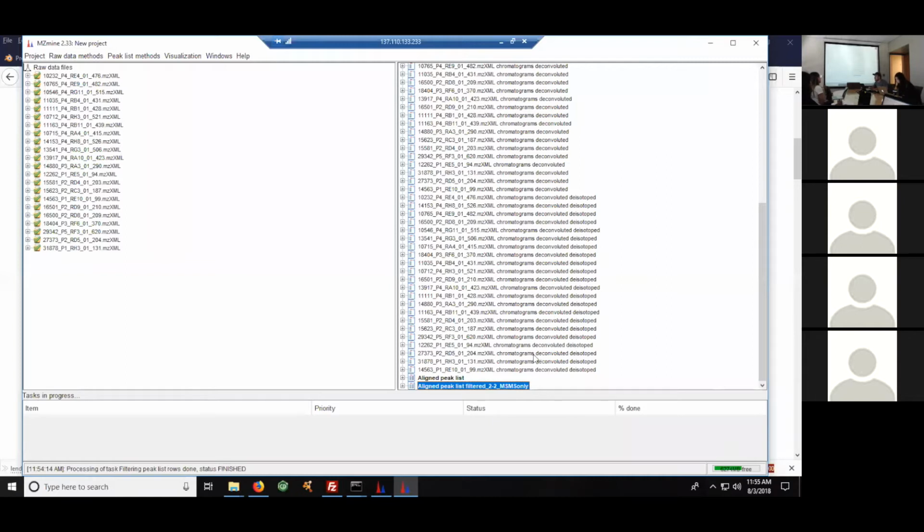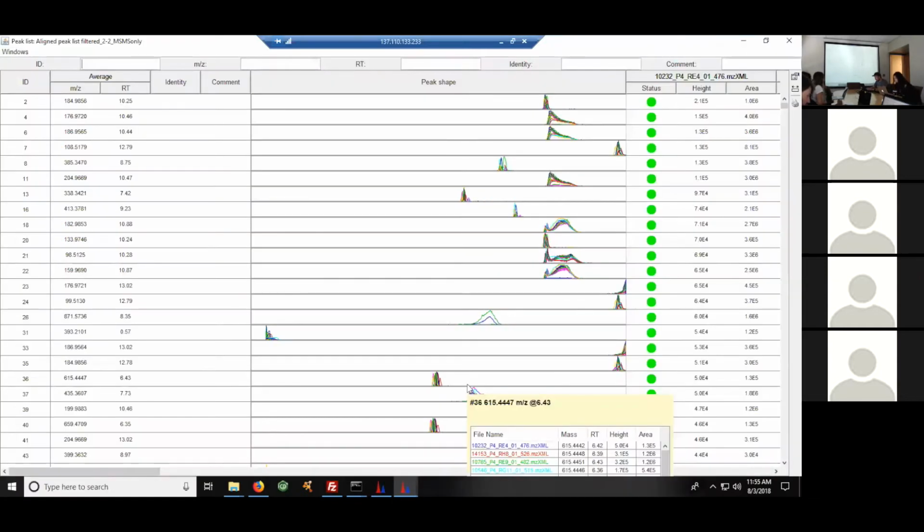So this information is retained, and for some other applications like Sirius in silico annotation, we actually rely on this information downstream to also make use of the isotope peak pattern as qualitative information. Anyway, you can see that we had a massive reduction.